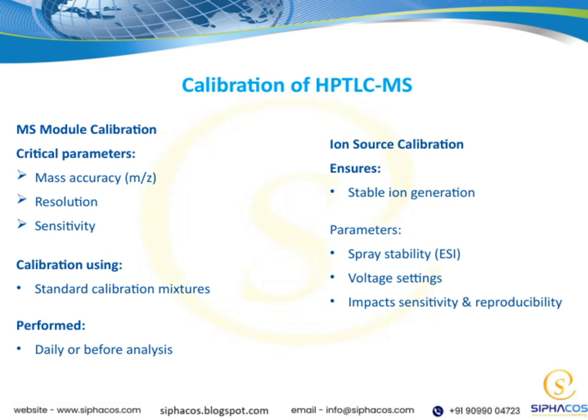Finally, it's important to remember that calibration isn't just a one-time task. For our HPTLC MS system, regular calibration helps maintain accuracy and reproducibility across all our analyses. By consistently checking and adjusting these parameters, we ensure our data remains reliable and our results trustworthy.